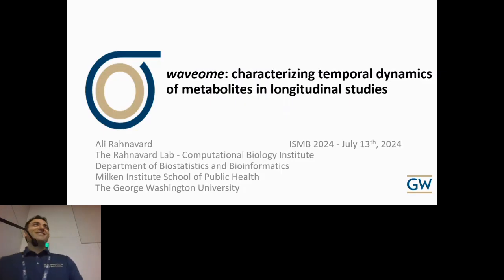Thank you so much, organizer, for the opportunity and for attending this session. My talk is going to be a little bit different from the previous one. It's very focused on one module, the computational tool Waveome, that helps to analyze and characterize the dynamics of omics in general and is applied to metabolomics to show the patterns we see in longitudinal studies.